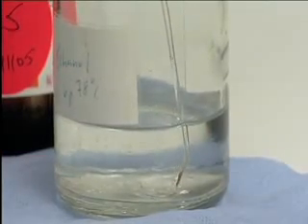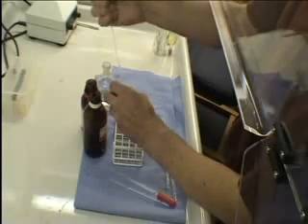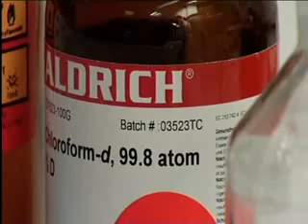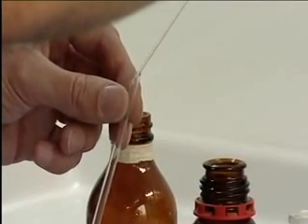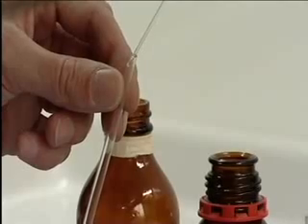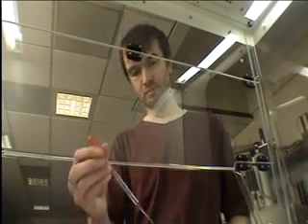Here we will run the proton spectrum of ethanol. A small amount is taken and dissolved in deuterated trichloromethane. This solvent is trichloromethane, in which all the hydrogen atoms have been replaced by deuterium. This is so that the signals from hydrogen atoms in the solvent will not be mixed up with those in the sample.